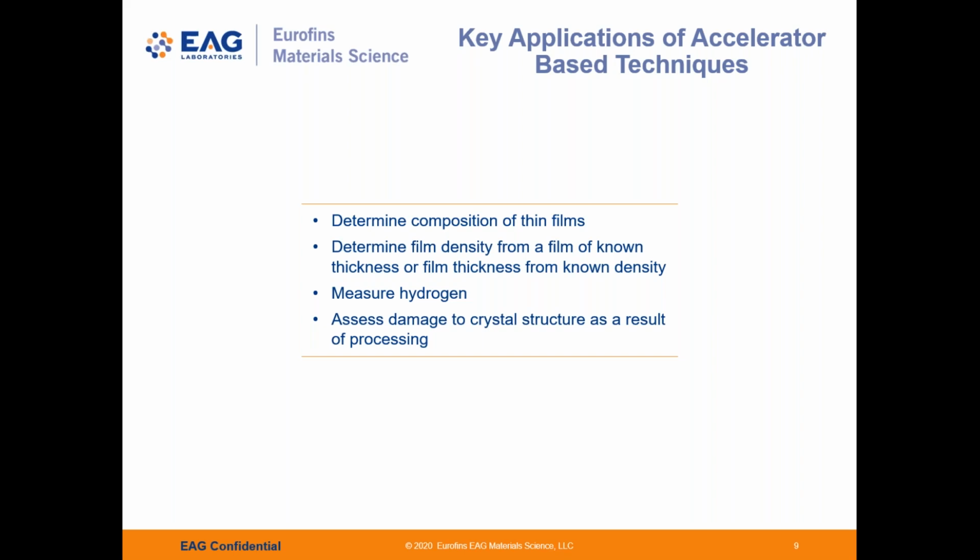Okay. The primary, hang on a second. The primary applications of RBS and the accelerator-based techniques are as follows.